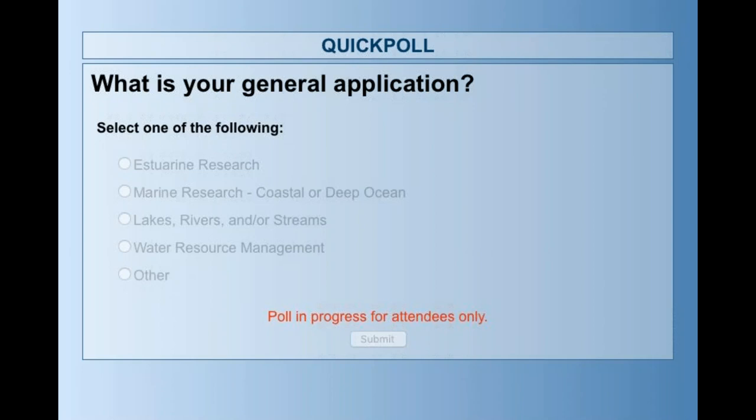One question we might want to reiterate while we're taking the poll: what water or solution depth is required for accurate readings? The amount of water you would need is essentially the amount required to cover the glass bulb, junction, and temperature sensor. Probably maybe like 2.5 to 3 inches. And if you deploy it that way and the water doesn't leave, then you should be able to have your Bluetooth on and accessible all the time.